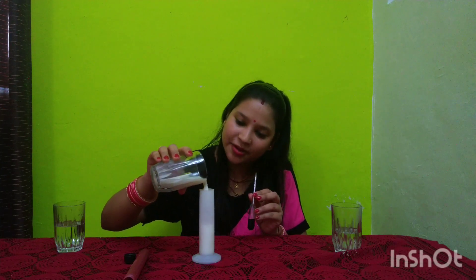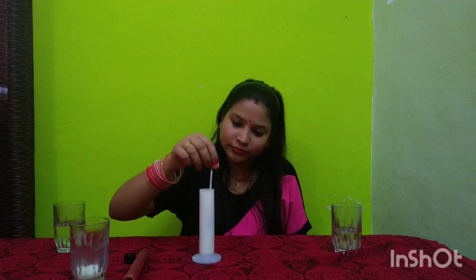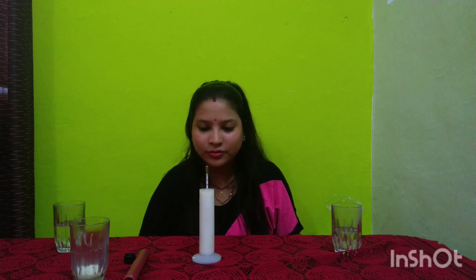I will fill the cow milk into the jar and dip the lactometer. As you can see, the reading is approximately 32, so the cow milk is pure. You can also read the water concentration scale on the side of the instrument.